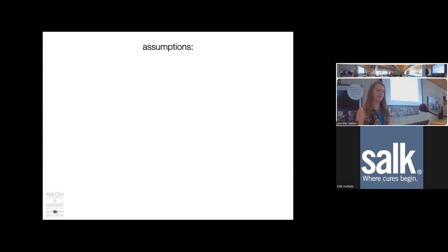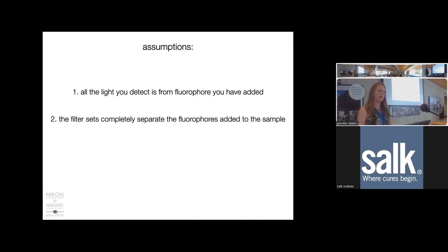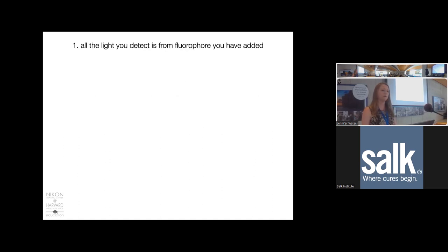Separating channels this way requires two significant assumptions: that all the light detected is from fluorophores we've added to the specimen, and that the filter sets completely separate the fluorophores in the sample. Let's go through these assumptions and talk about where they can fall apart and how you need to address them.